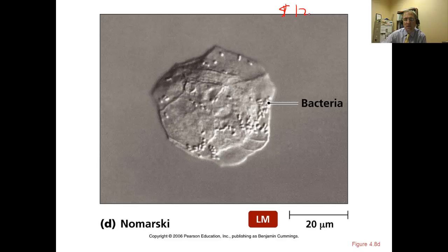that we saw before. With this, it's the exact same slide we were looking at before. The boundary of this cell is in extremely sharp focus. These bacteria that we saw before are obviously laying on the top surface of this cheek cell.